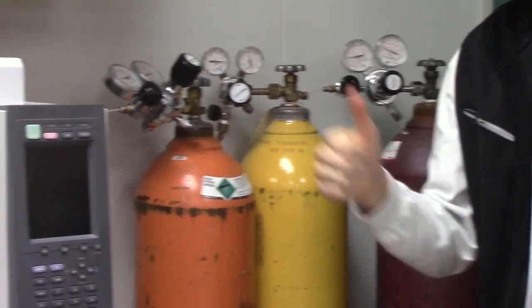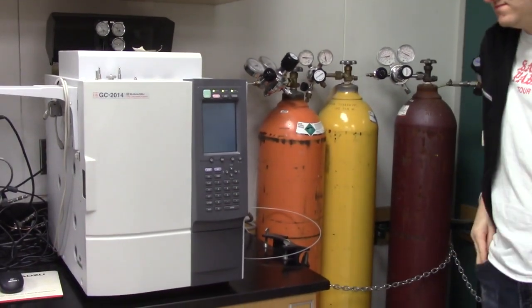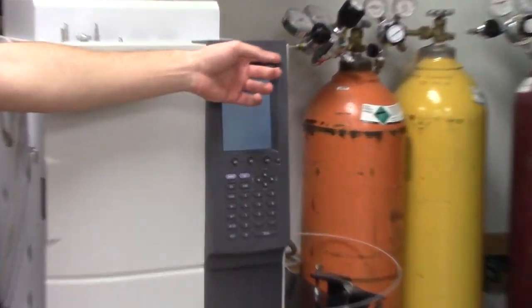Next, Adam's going to turn on the instrument with a button located on the side. As you can see, all three lights are green.